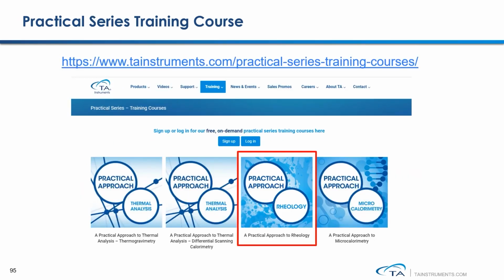There are also a series of practical training courses on our website, which include thermal, rheology, and also microcalorimetry. Those courses are mostly focused on thermal and rheological measurement theories.